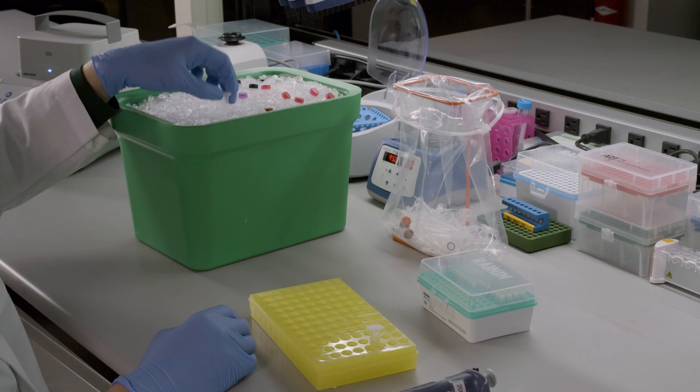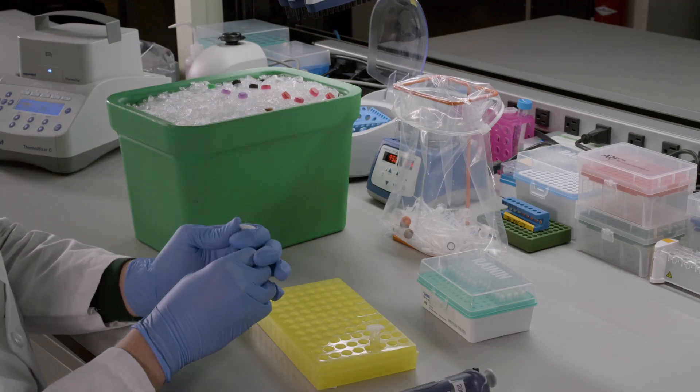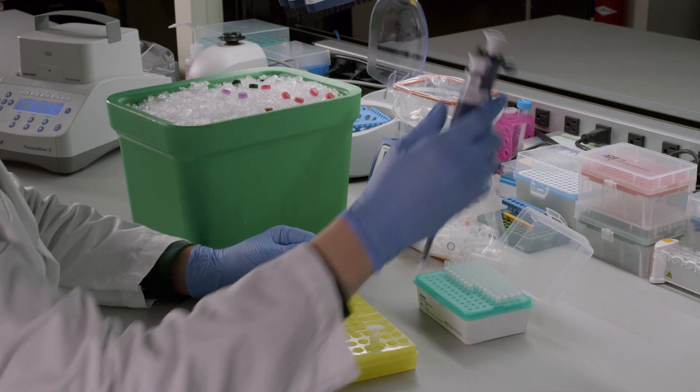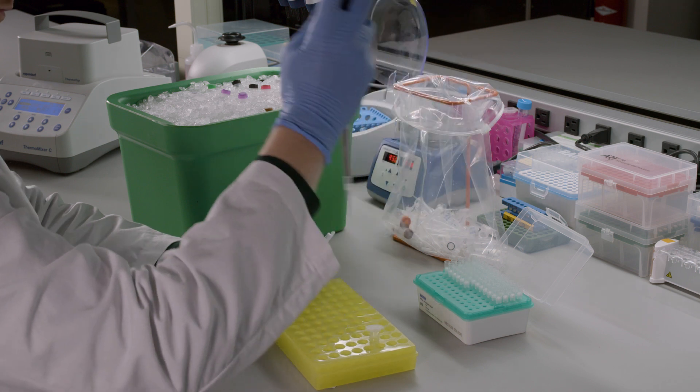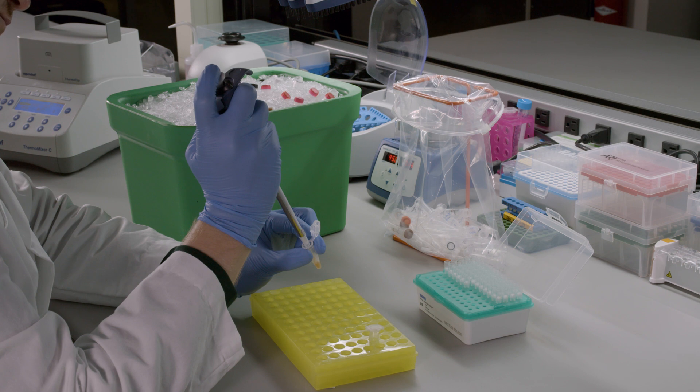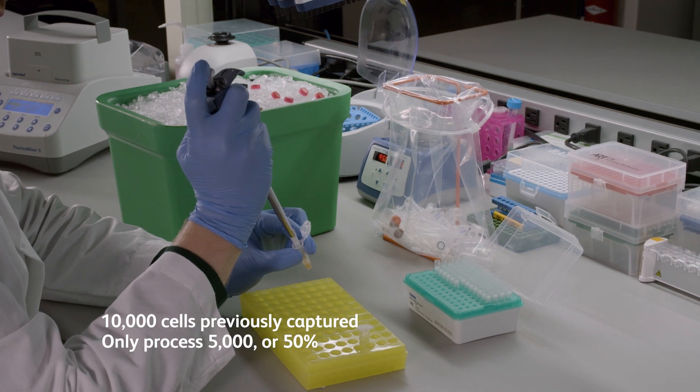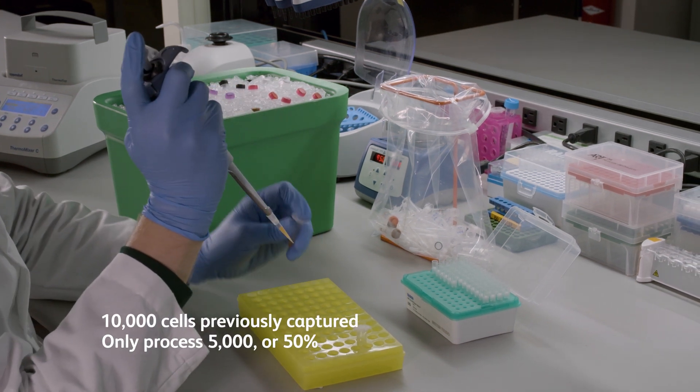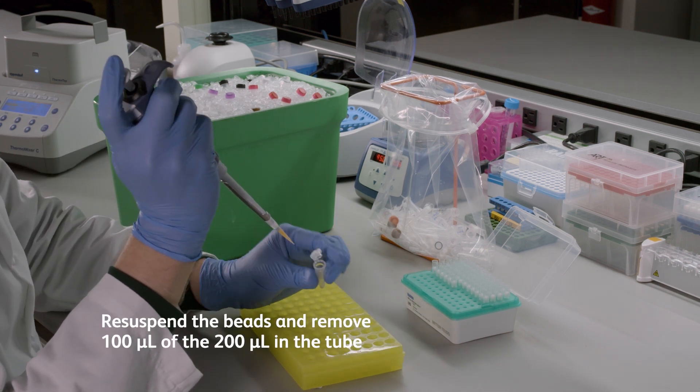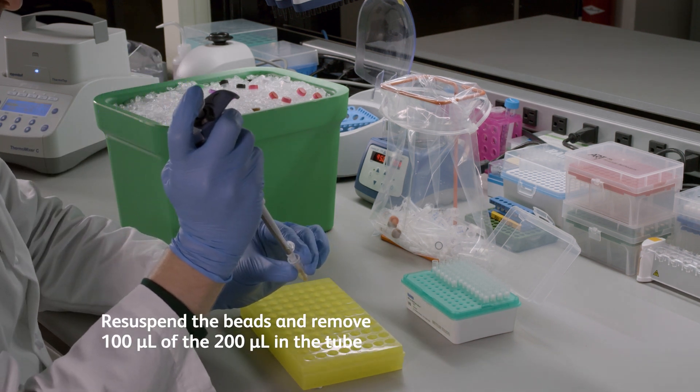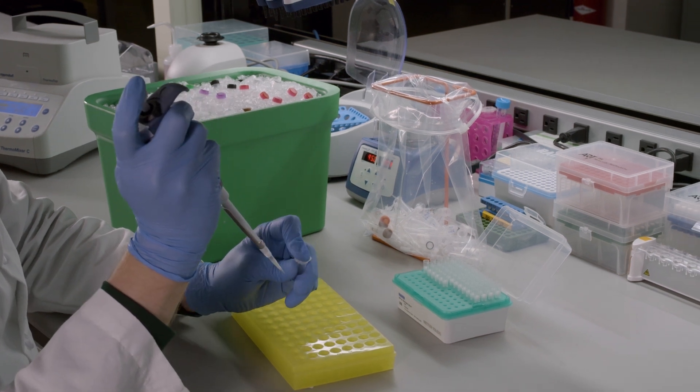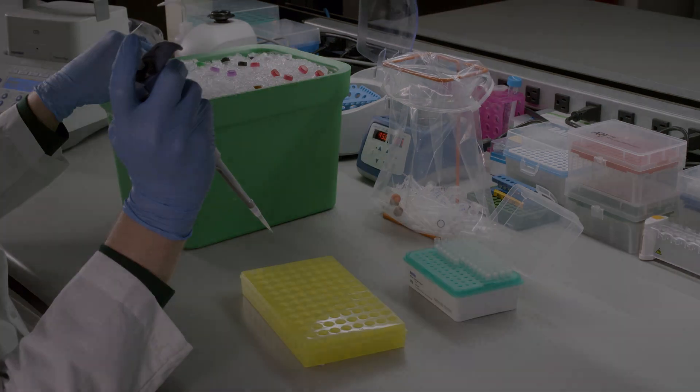We'll be starting with the exonuclease treated beads from the cDNA protocol. If you wish to subsample for future use, you can calculate the volume of beads to remove as a proportion of the cells captured. In our example, we previously captured 10,000 cells but only want to process 5,000 or 50% of them. To do this, resuspend the beads and take 100 microliters of the 200 microliters in the tube. The remaining beads can be stored at 4 degrees Celsius for up to 3 months.